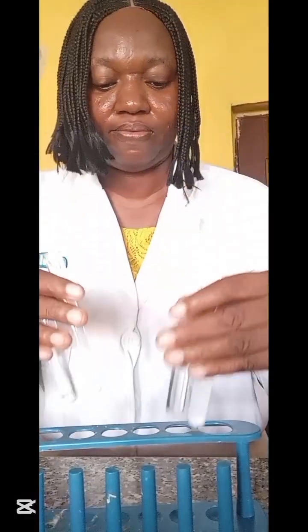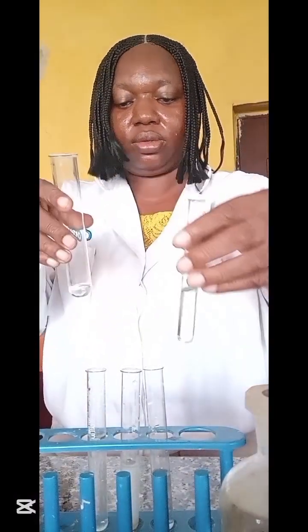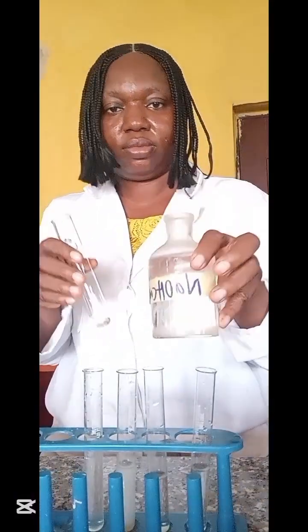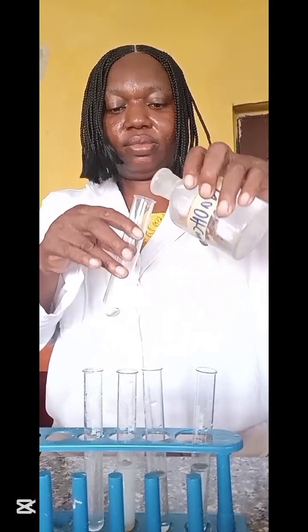These are the white salts that I want to test. I'm going to be using this as an example. So the first one, sodium hydroxide. See what I'm saying? This is a white gelatinous precipitate.